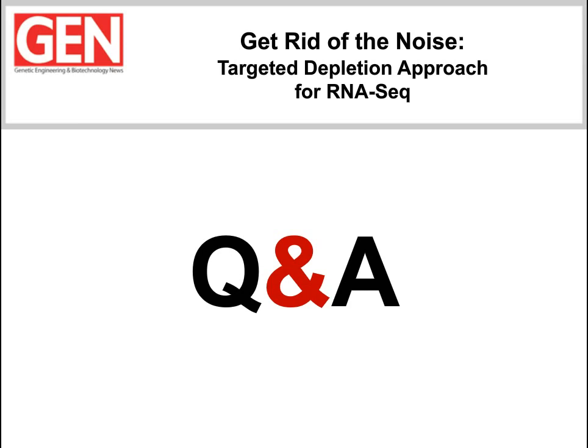A good question. So what we typically do here and what we advise our customers to do is first to run an Agilent Bioanalyzer High Sensitivity DNA chip to look at the trace, the size range of your libraries. If you're seeing a nice broad peak centered around 320-ish base pairs, again, as I mentioned earlier, that can fall slightly lower if you're using degraded RNA samples.